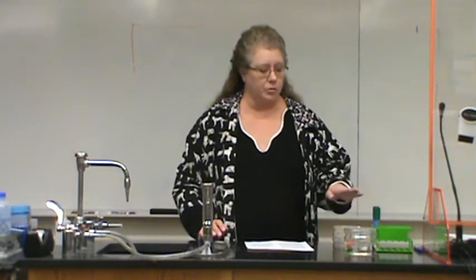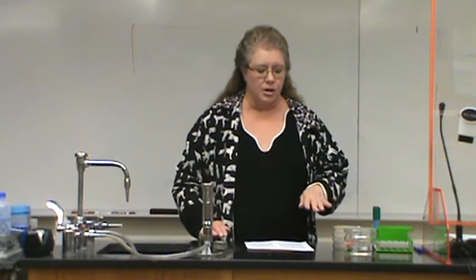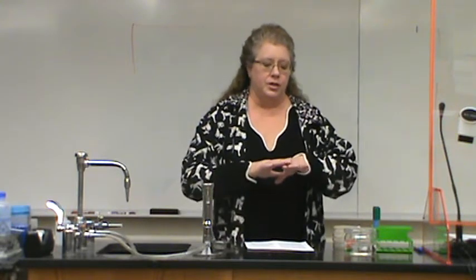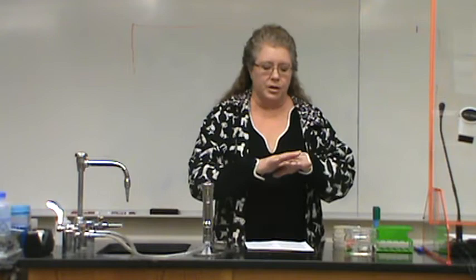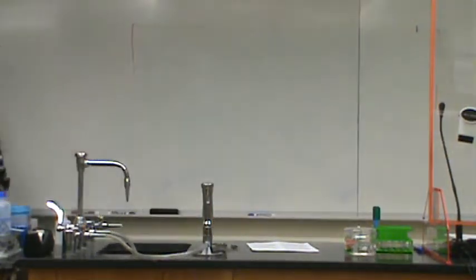We also have 4 Mueller-Hinton plates. Mueller-Hinton is a specialized agar that is used for this particular test. It allows the antibiotic to filter out from that disc at a certain rate so that everything is equal and you get nice zones for the most part. So I'm going to go through how you would do one of them, and you would do that for all 4 bacteria. Okay, so we'll go through one.